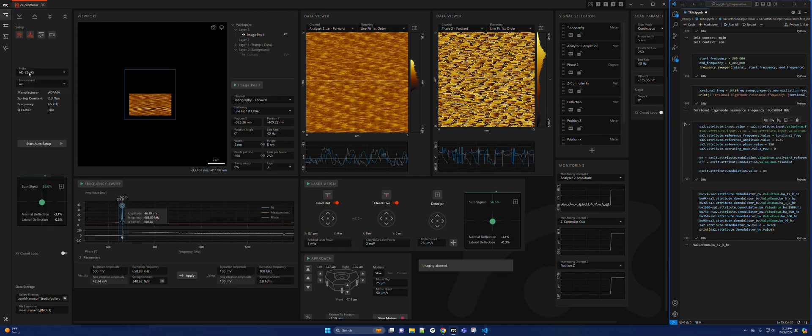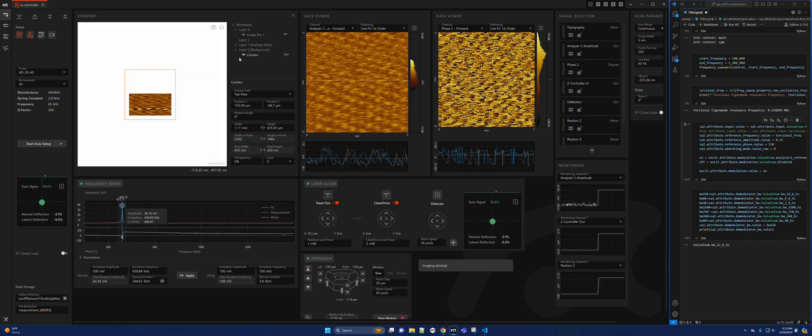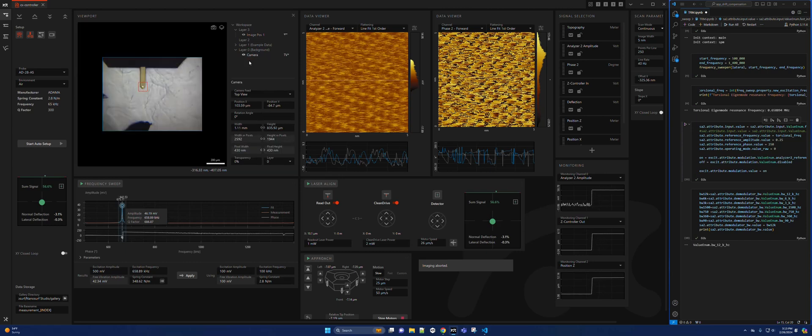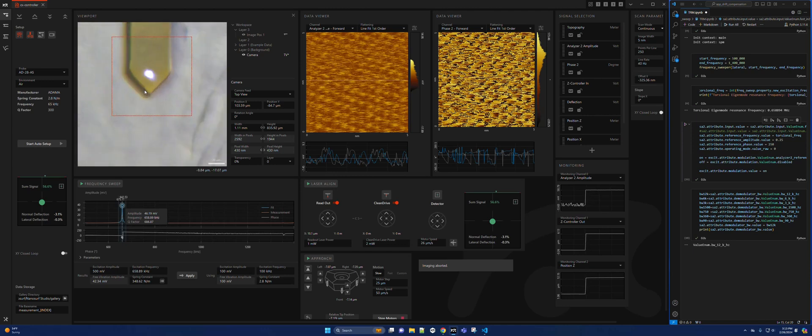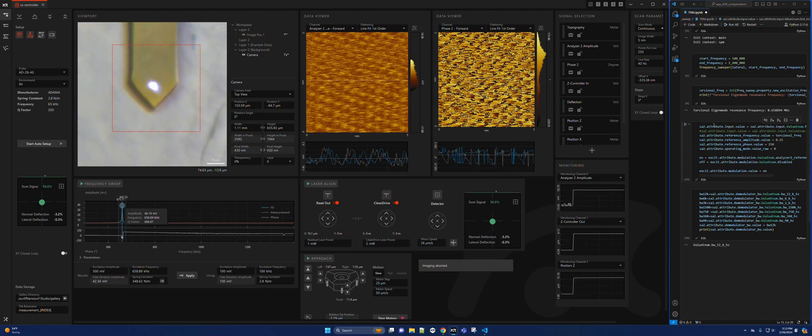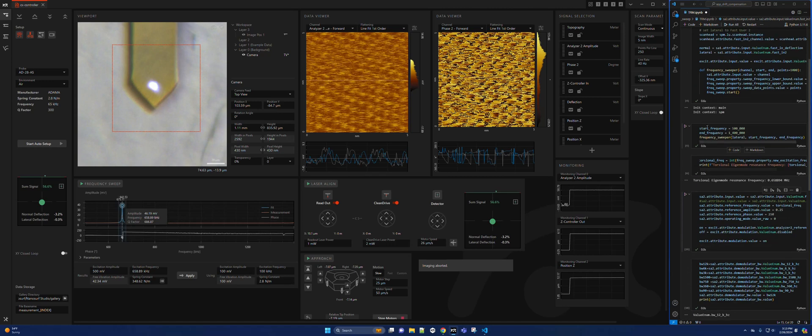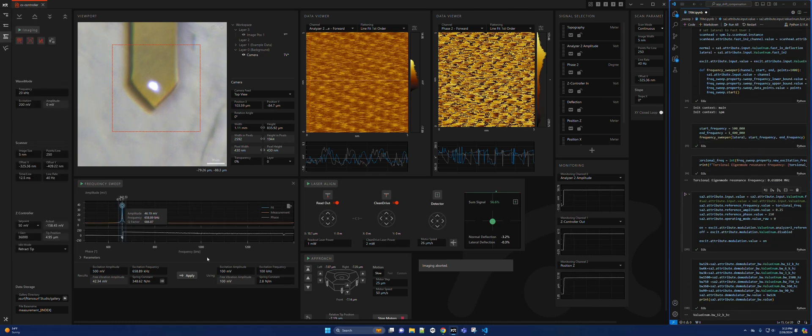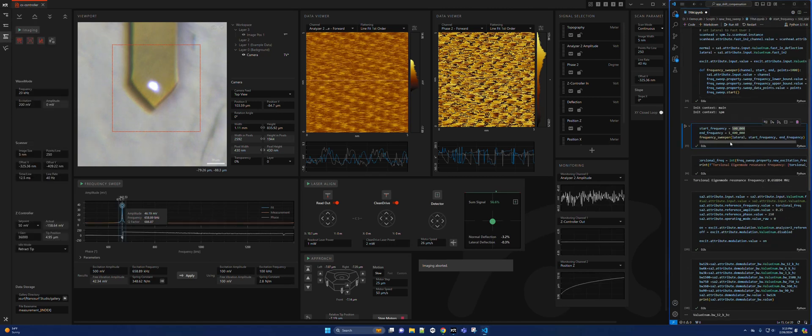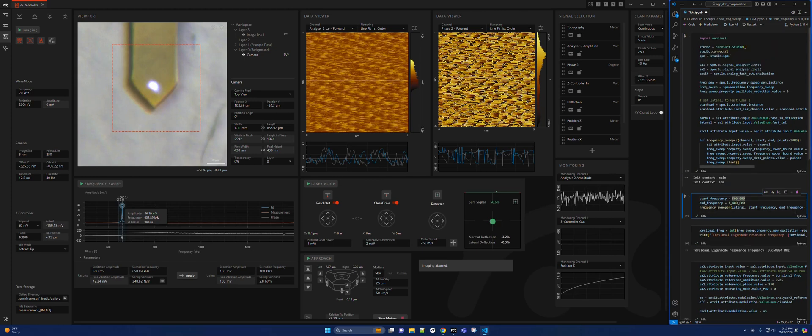First I selected the cantilever and made sure the laser was aligned to the cantilever correctly. Then the second step is to calculate and find the torsional resonance, and for that I use a Python helper script.